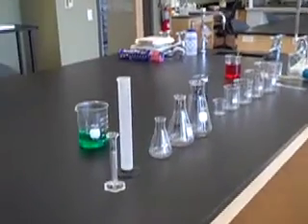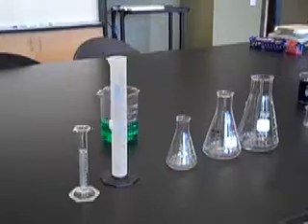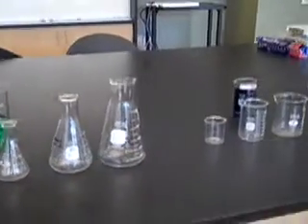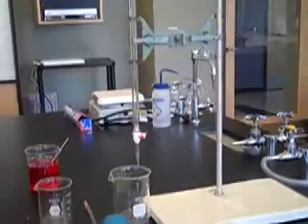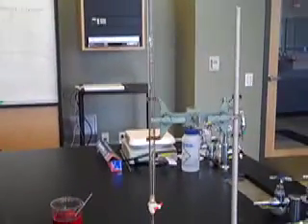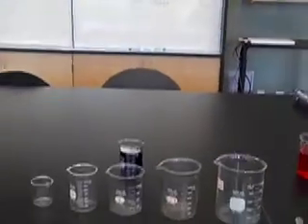During this presentation, we will show you four different types of glassware that can be used to measure fluids. First, we'll take a look at our beakers.